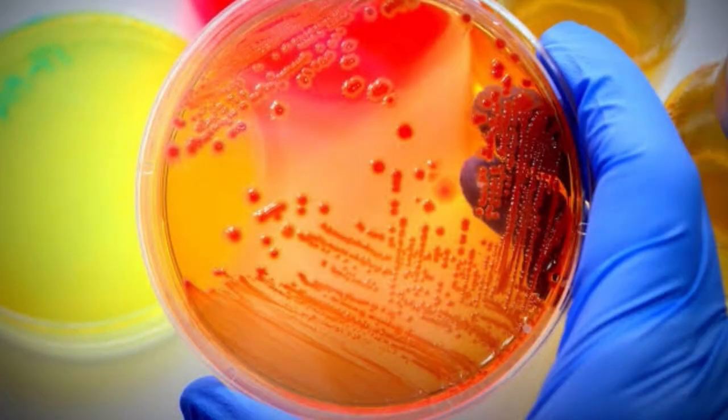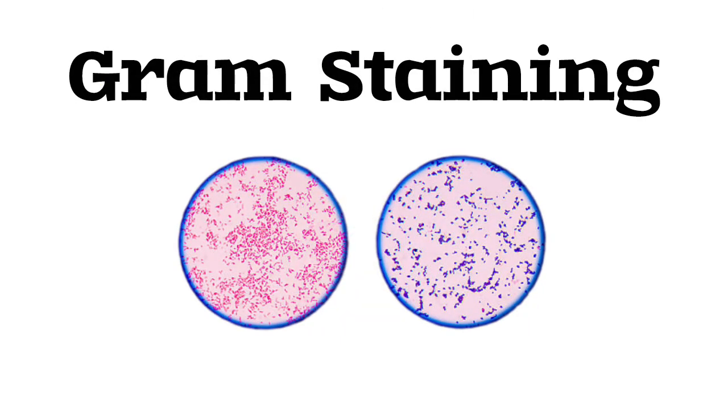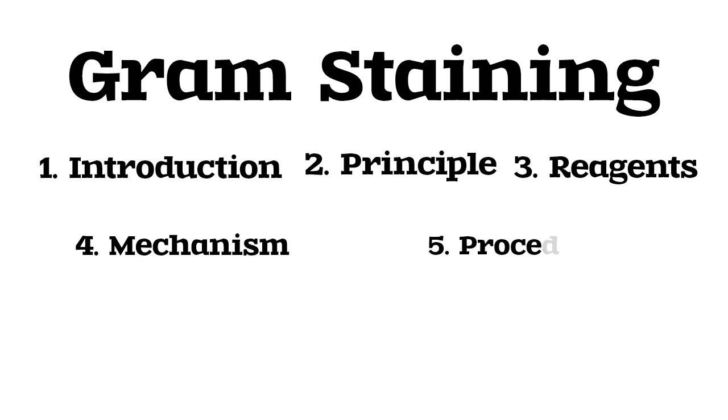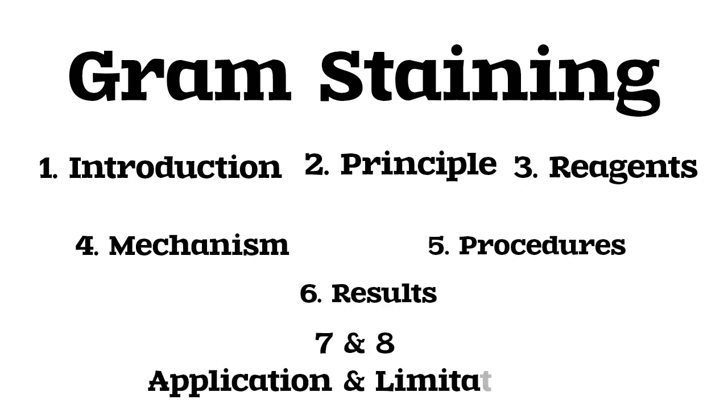Today I am going to discuss a topic of microbiology, that is gram staining. In this topic, I am going to discuss the introduction first, then the principle behind it, reagents involved, mechanism, procedure, then result, after that application and limitations. Let's begin with the introduction first.